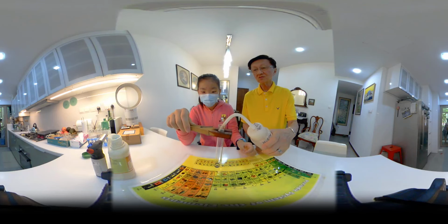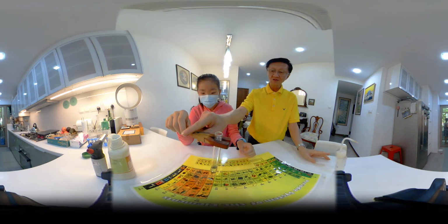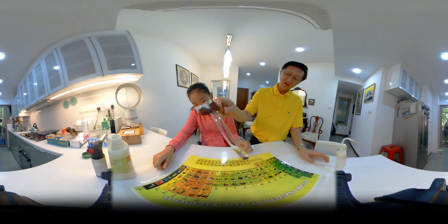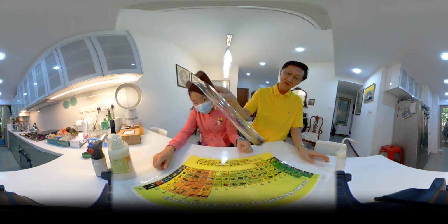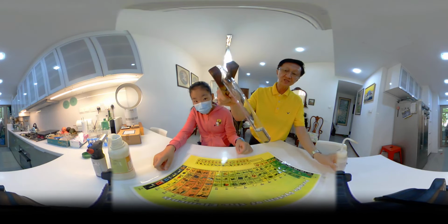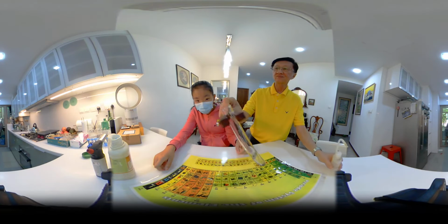Shake more. Doesn't seem to dissolve right now. But then we're going to heat this.